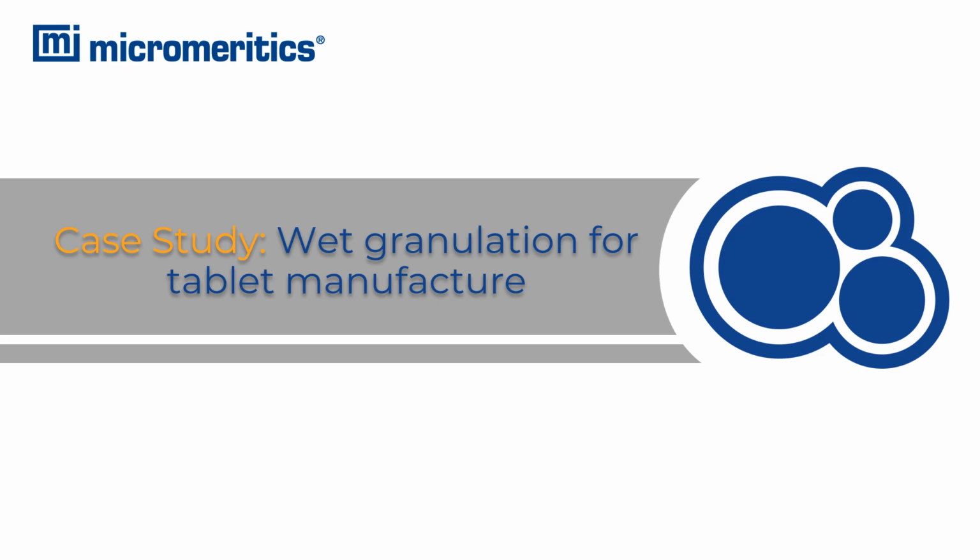To compare the two approaches, we'll look at a pair of case studies. Both of these studies can be seen as successful applications of their respective approaches, but we'll consider whether or not one method might be more useful than the other. Firstly, let's take a look at wet granulation for tablet manufacture, which attempts to link a single rheological property to the final product quality of a pharmaceutical tablet.